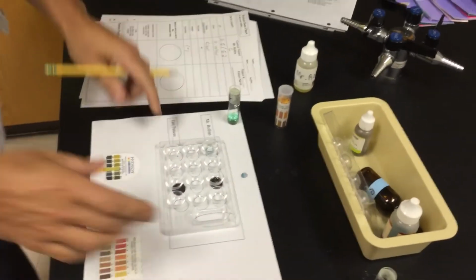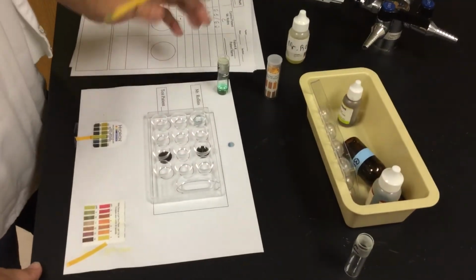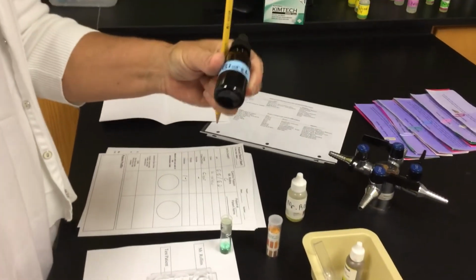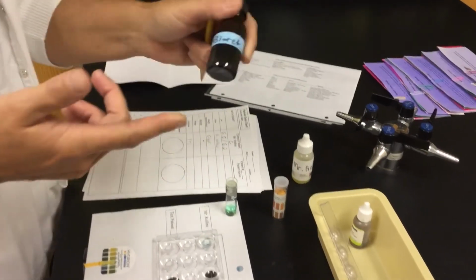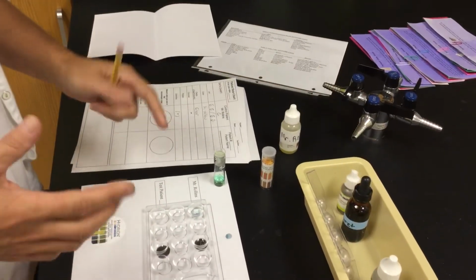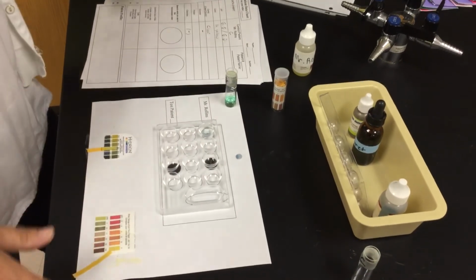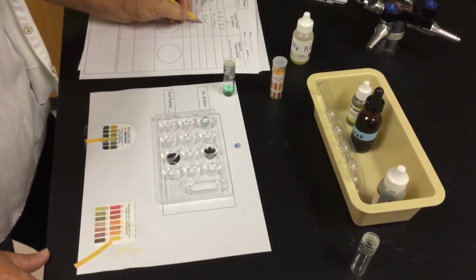My proteins, we're saying 3 minutes. Nope, there's no color change there. It's still blue, and it's blue because we added biuret solution, which is blue. So don't go, oh, it changed colors. It changed colors because of the solution that we added. There was no chemical change, and if there's a chemical change, it is going to turn either pink or kind of a purple. You'll see a definite change within that 3 minutes. So I'm going to say my proteins are negative.